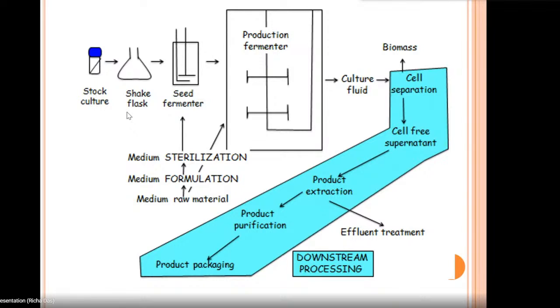So that is a failure, and we don't want such scenarios, because if we directly use the large fermenter, then we are not only wasting time but also a lot of money to give out a wrong product. That is why after you have isolated your pure culture, the next thing we do is produce our product in smaller amounts. And when we observe that our desired product is getting produced, only then will this large fermenter, as we can see, be used.